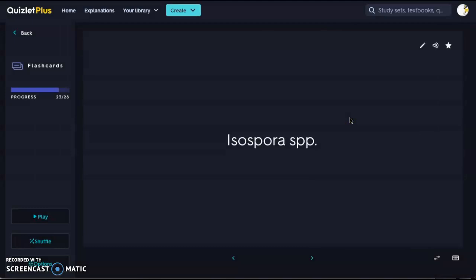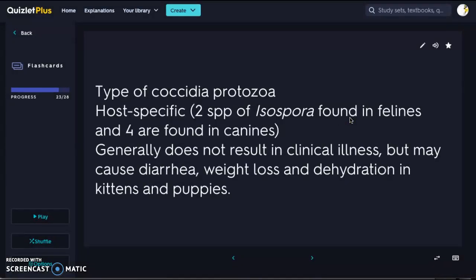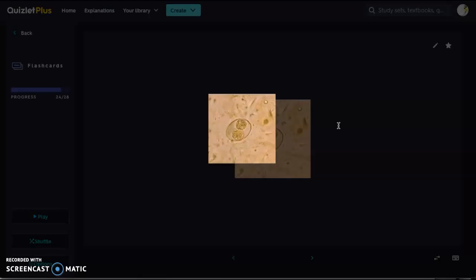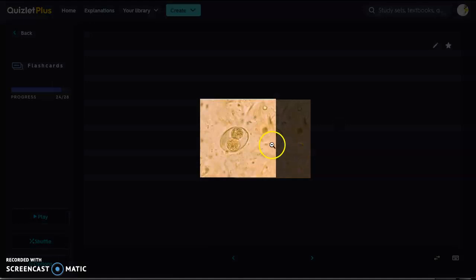Now we're getting into the protozoa. We have Isospora species, which is a type of coccidia protozoa. They are host-specific — two species are found in felines and four in canines. They generally do not cause clinical illness; most animals will have coccidia in some form and the body fights it off. But if there is an overabundance, you may see diarrhea, drastic weight loss, or dehydration, especially in kittens and puppies.